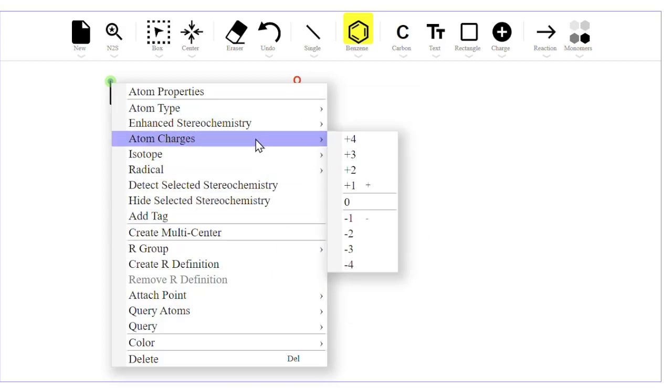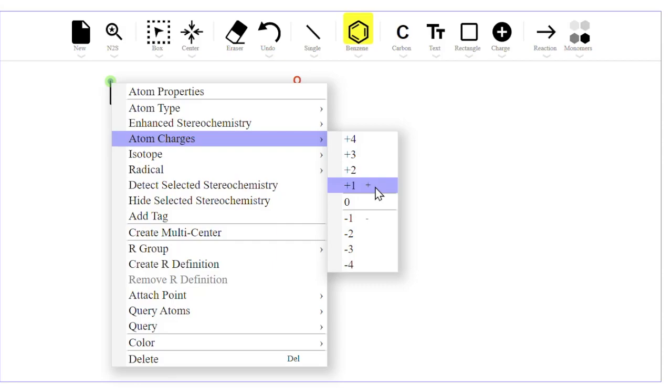For atom charges, if you point and press the plus key or even the non-shifted equal sign, the atom charge will increase by one. If you press the minus key, the charge will decrease by one.